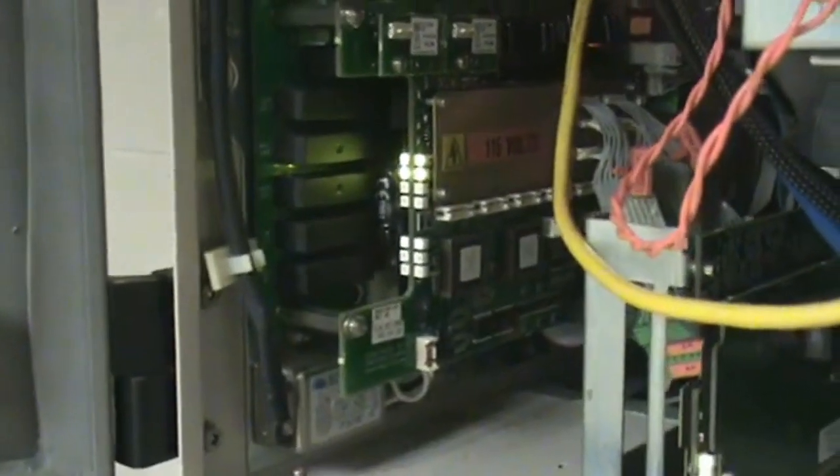That is your distribution of power coming in. So there's your 120 coming in, going through a whole bunch of fuses and everything. Your over temp protection is these guys right here for your oven over temp protection. If you ever have to change that card out, you're going to have to pull these off of your old card and put them on the new, because the new card doesn't come with them. How do I know that? Trust me. It whooped me one time. So learn from my mistakes.